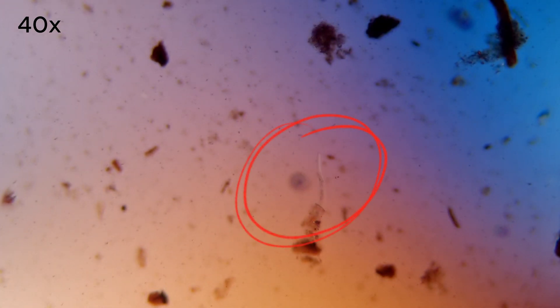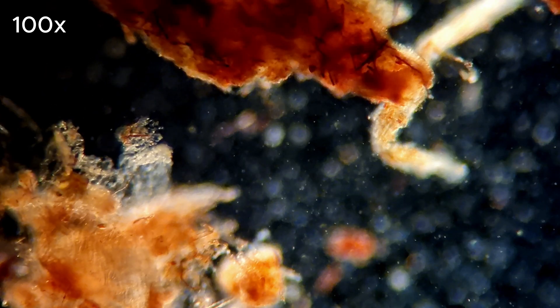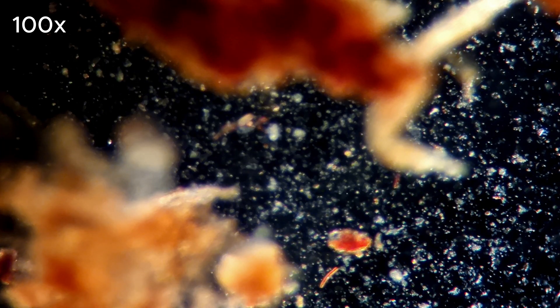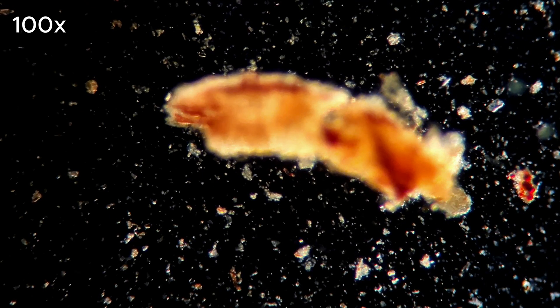Except for this little fellow — he is definitely alive and appears somewhat puzzled. To observe the tiniest bits and particles I'll go back to using dark field once again. I don't think the Brita filter stands a chance here. Nevertheless, let's put it to the test.